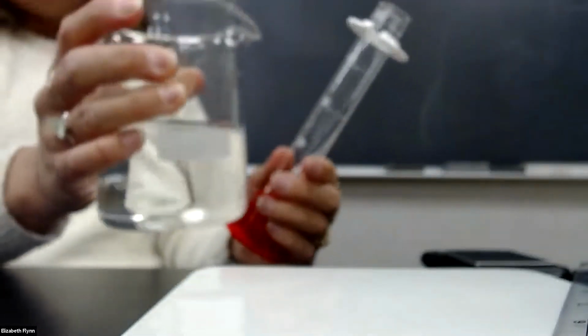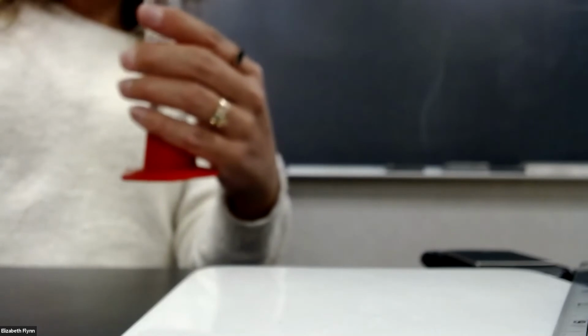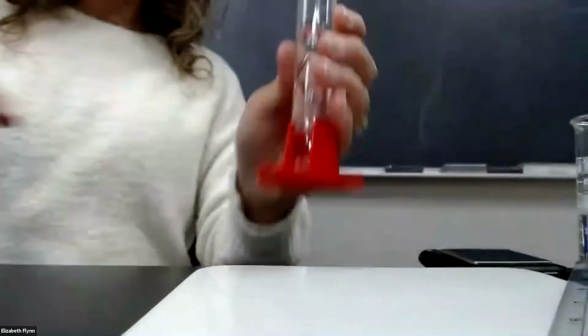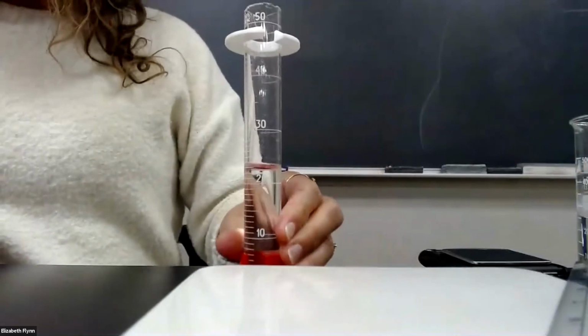It doesn't have to be very much. The important thing is just that we record the volume precisely. Maybe 20 something milliliters. That should be just fine. Bring it down here.